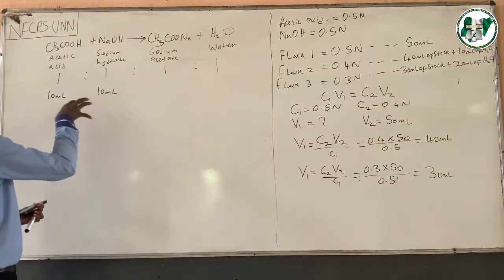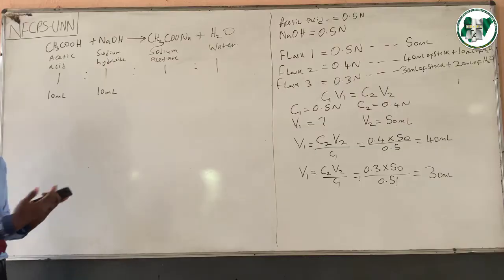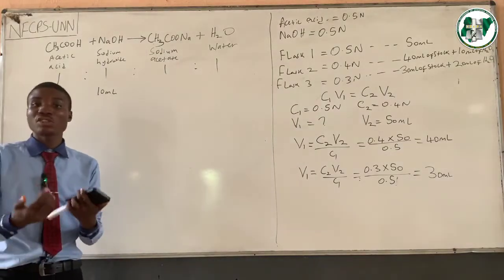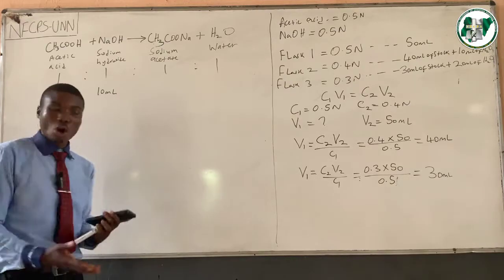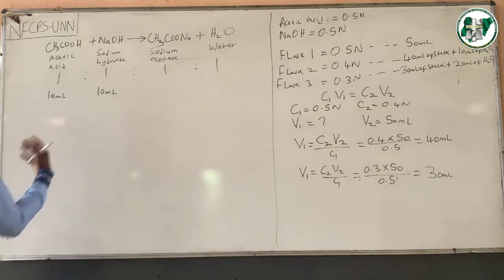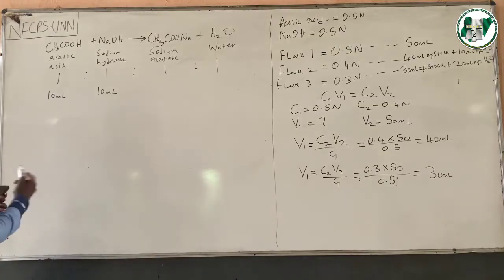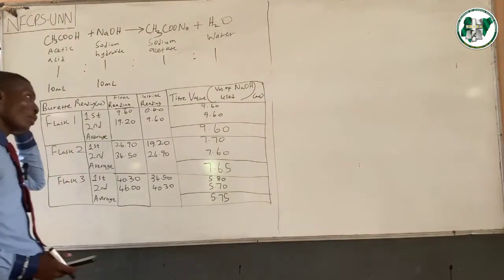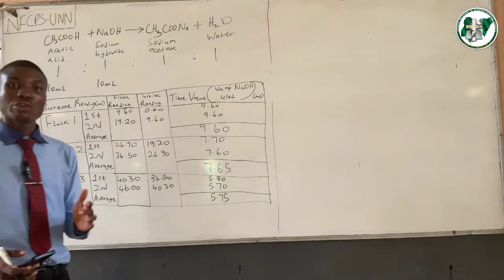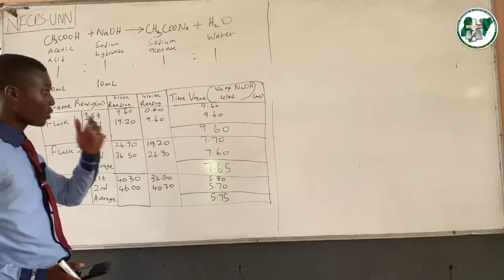So we are going over now to the titer value that can work for this particular experiment, based on what has been carried out and the necessary analysis done prior to this time. We're going to draw our titer table and make progress on this part. Here is the table showing our titer value for the different stages of the experiment.